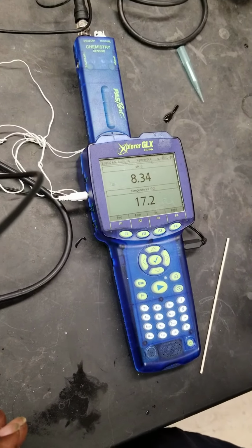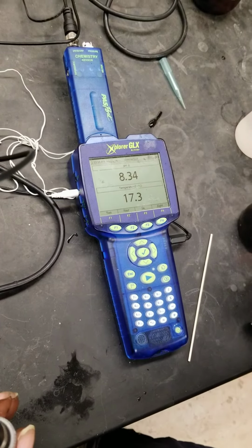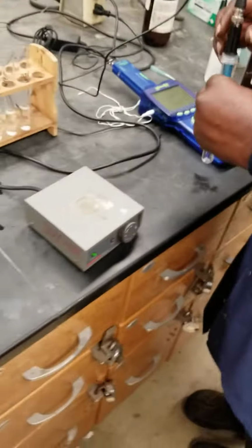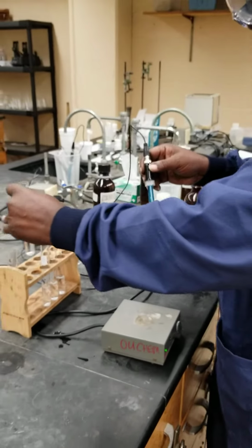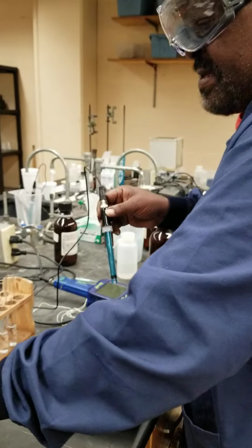Let's read that as 8.34. We are done with the ammonia system.